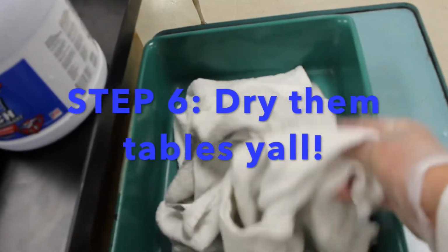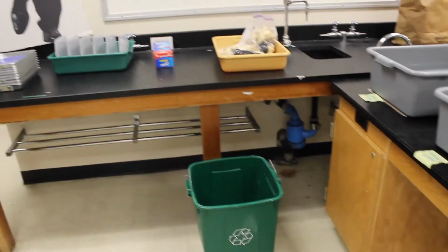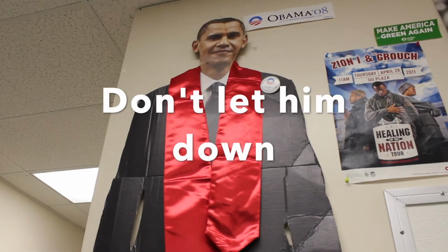So dry rags are here at the end of the table, and we use these to dry. So once your table is dry, everything's cleaned up, you can move on to the next part. Make sure you keep your PPEs on. He's watching you.